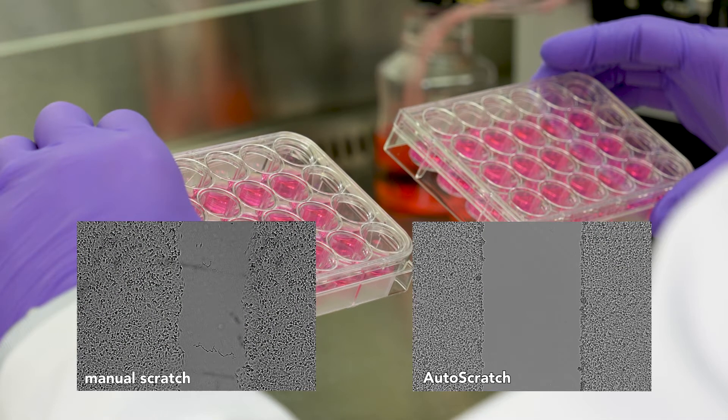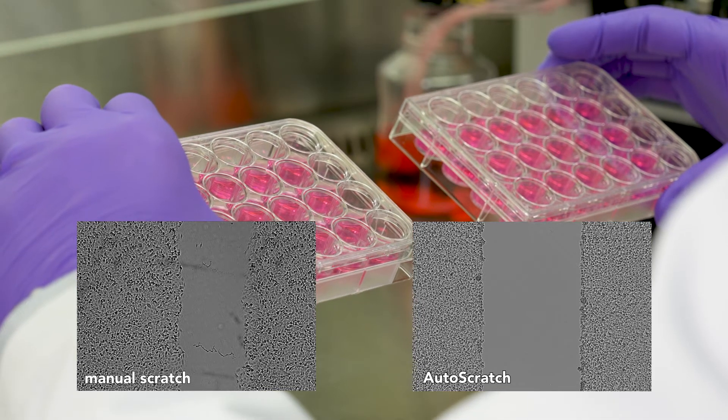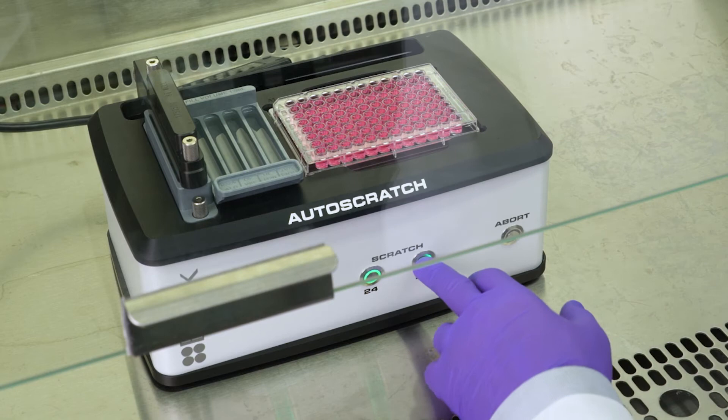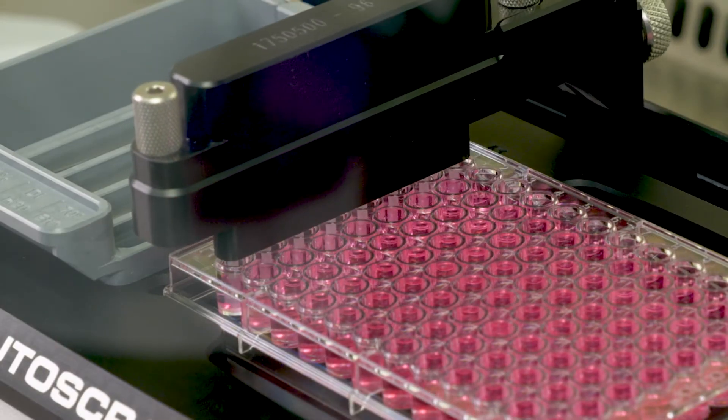A quick visual inspection reveals wound width and placement within each well is highly consistent across the entire plate. Additionally, the 96 well format, which is too small to manually scratch, enables high throughput applications.